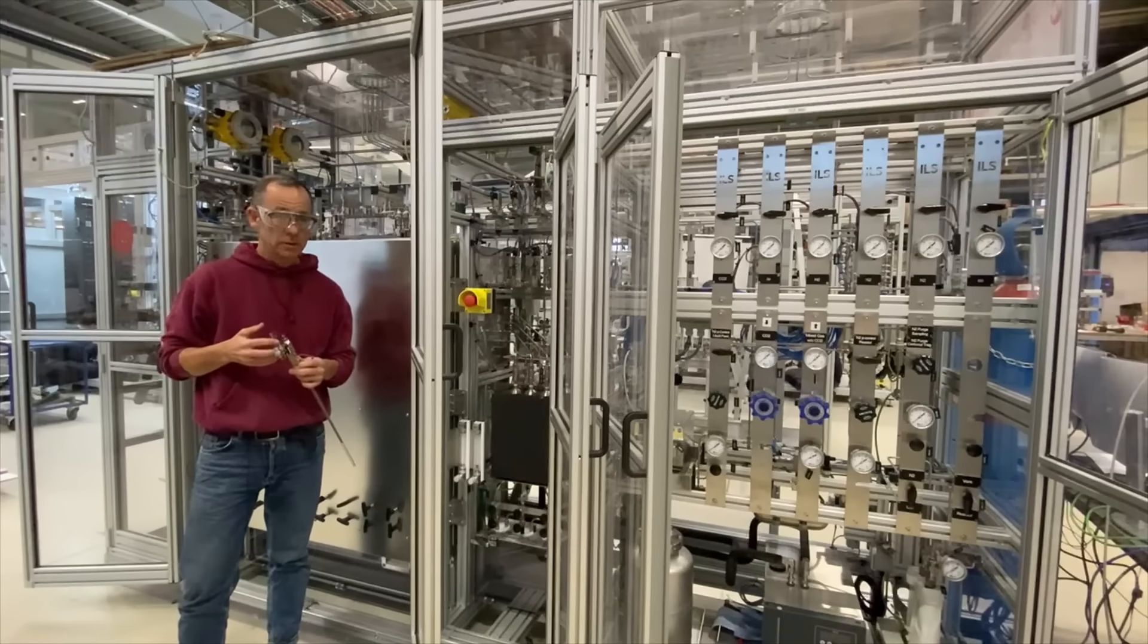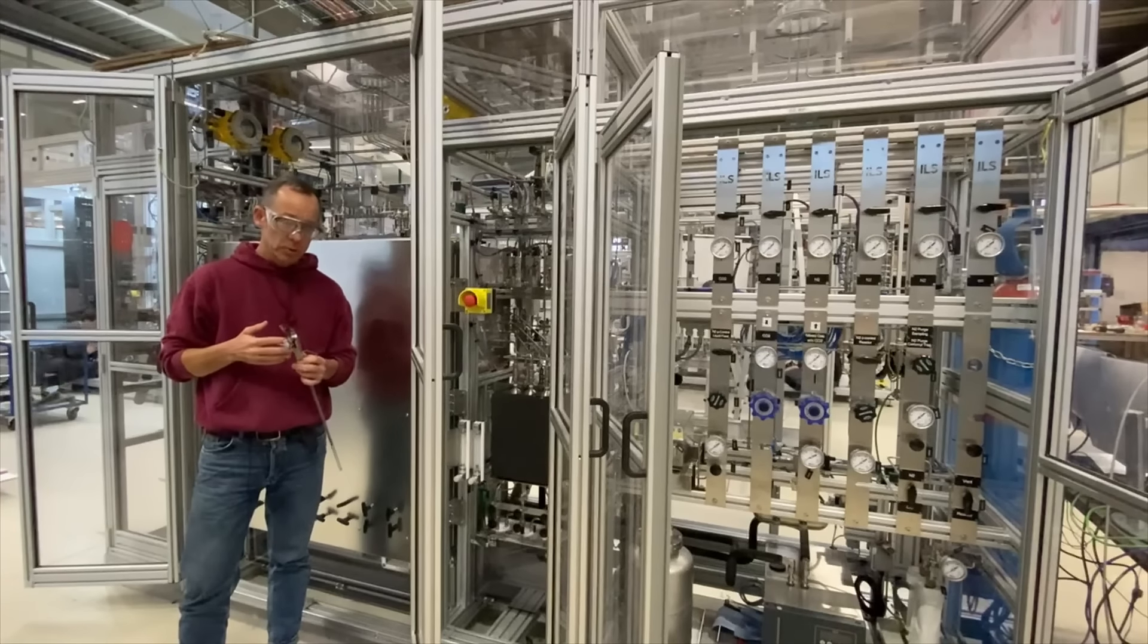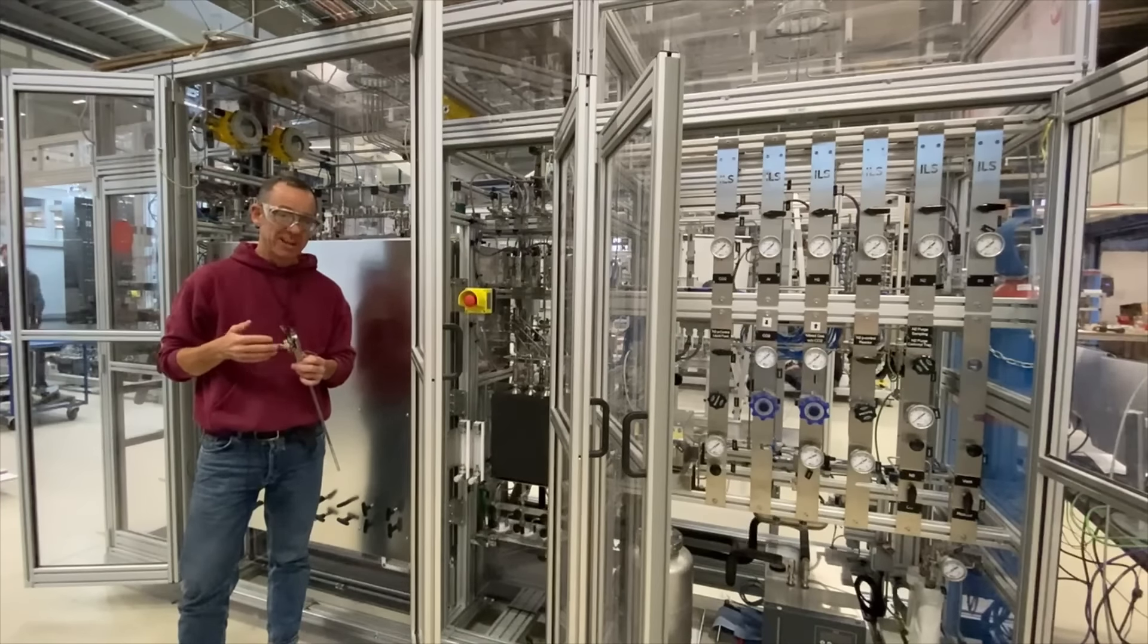In today's video I'll be giving you a brief introduction to one of our latest high-throughput fixed bed units. This is very much a multi-purpose unit, so it's capable of operating at up to 800 degrees, 100 bars.